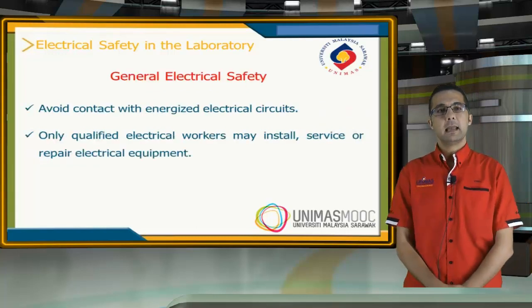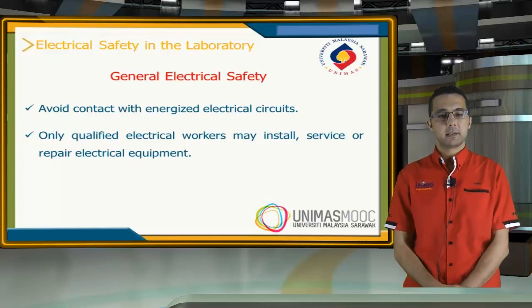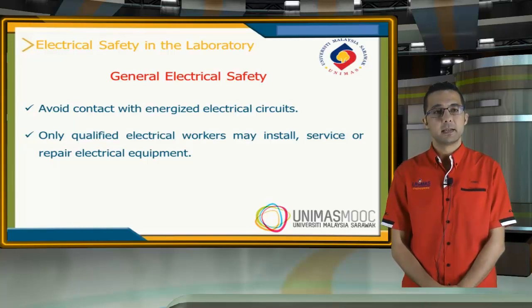As general electrical safety, always avoid contact with energized electrical circuits. Also, only qualified electrical workers may install, service, or repair electrical equipment inside the lab.